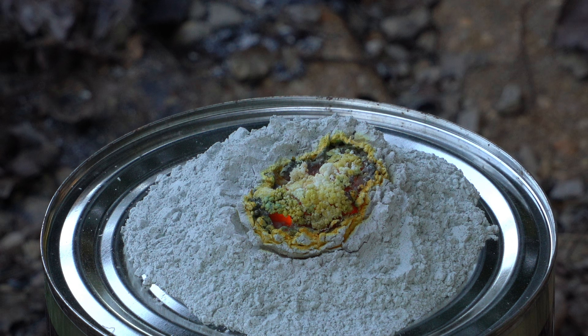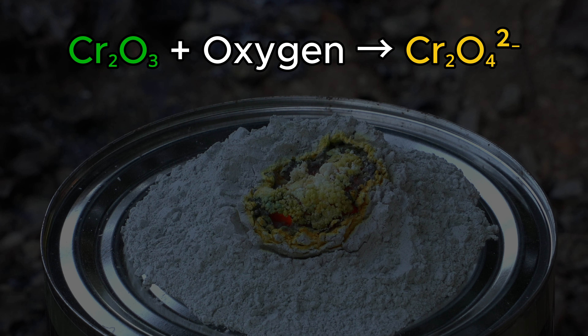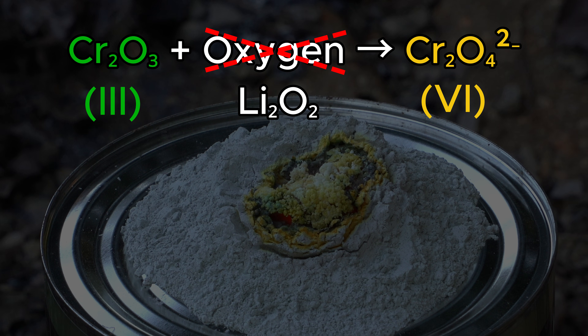But before we can break it open to see if this worked or not, notice that yellow coloration at the surface? Clearly this has to be something bad — after all, yellow equals bad in chemistry. It looks like a tiny amount of chromium oxide has been further oxidized to what I can only assume is lithium chromate. Chromates may be less toxic than their cousin dichromates, but we will still have to destroy this stuff through reduction later in the video. I'm more than willing to bet that this unexpected oxidation of trivalent chromium to hexavalent chromium occurred in the presence of lithium peroxide, a powerful oxidizing agent that just so happens to form when lithium burns in air.